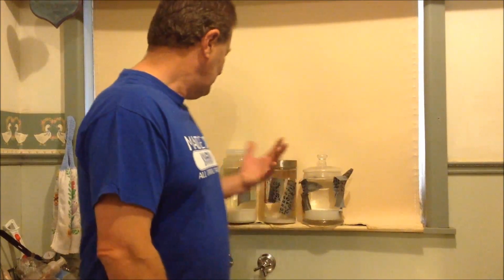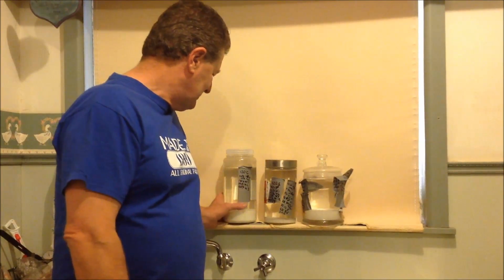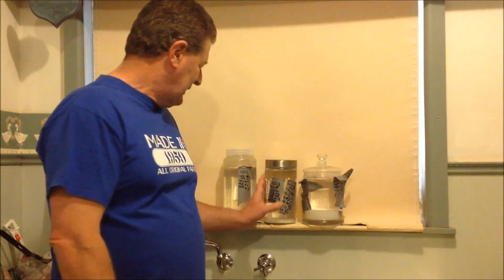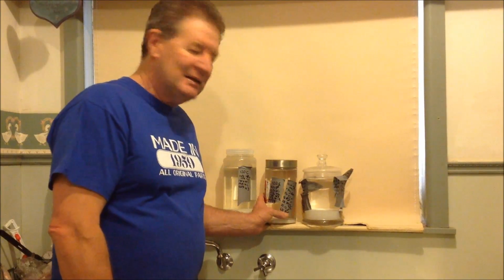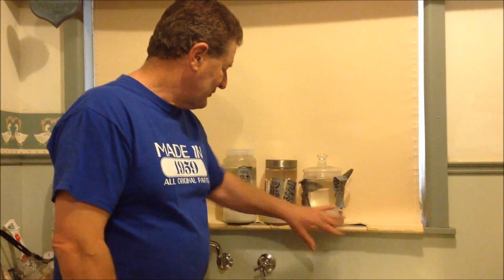Hi there guys, it's time to wrap up this particular experiment, which has been going for about a year now, believe it or not. Its principal design was to compare a first stage precipitate run up to 10.7 and then washed, with the second stage precipitate where it's taken back down to pH of 1 and then up to 8.5, 8.7, with the third stage precipitate where this is done another time.